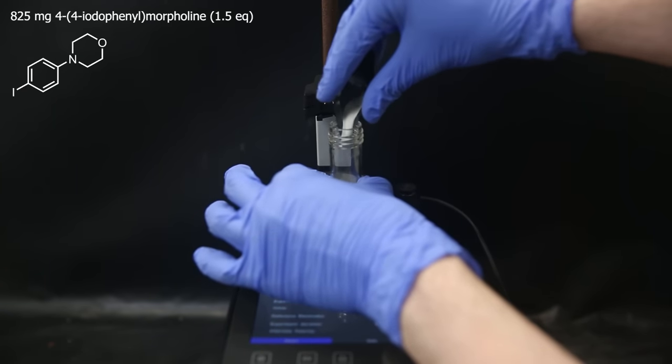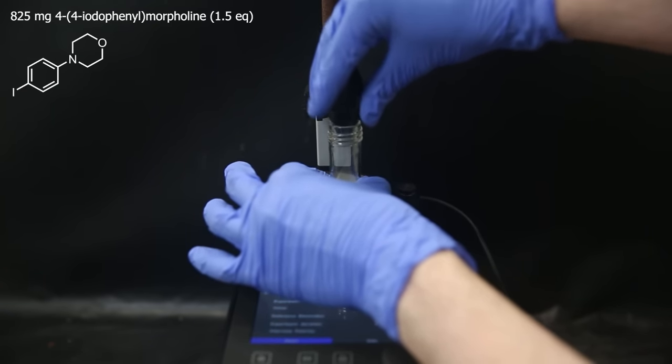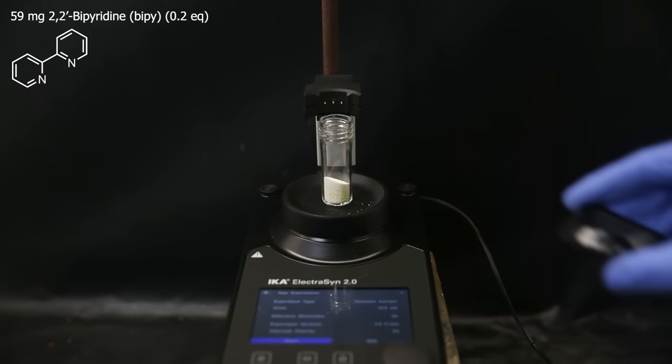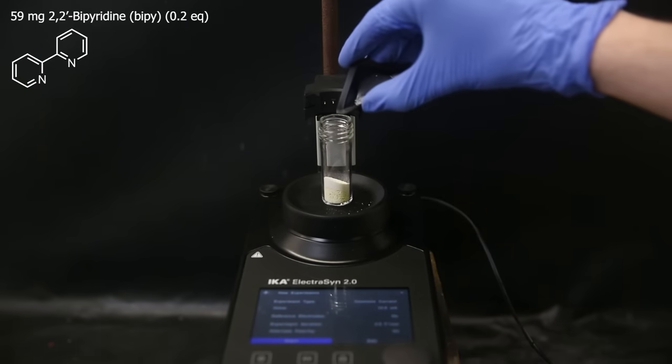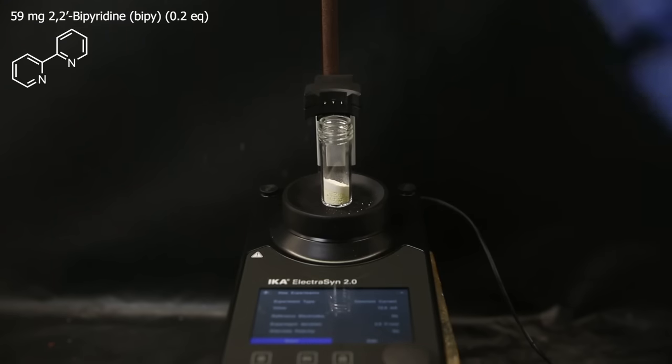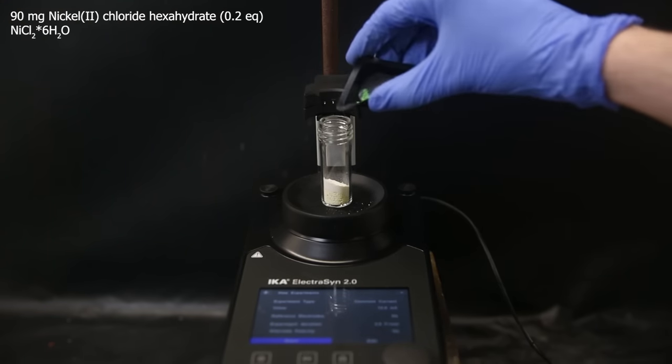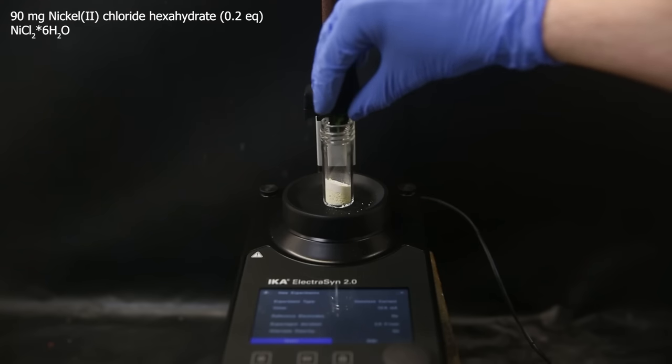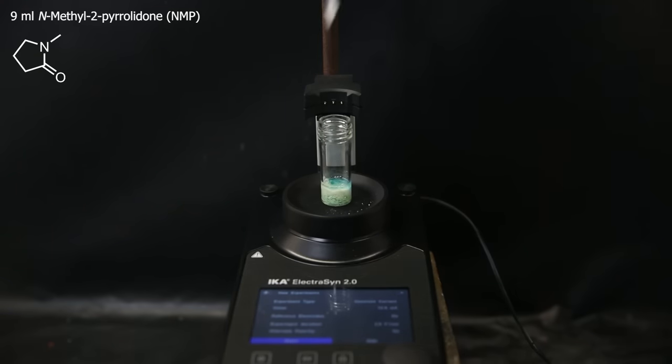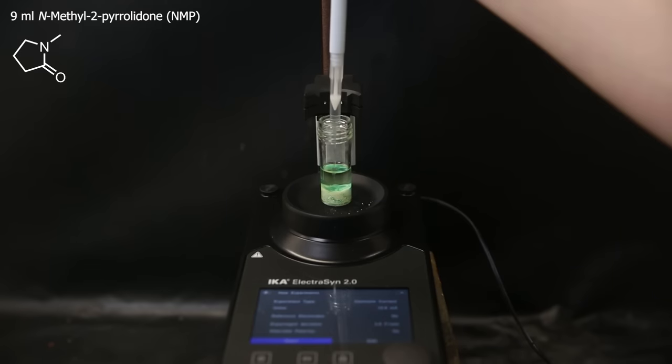Then as the second reactant, I add 825 mg of 4-(4-iodophenyl)morpholine, which can just be bought from a chemical supplier. Then the two reagents that allow the electrons to transfer to the substrate. So first, 59 mg of the ligand 2,2'-bipyridine, and then 90 mg of the salt nickel(II) chloride hexahydrate. As a solvent, I add in 9 ml of N-methylpyrrolidone, or NMP for short.